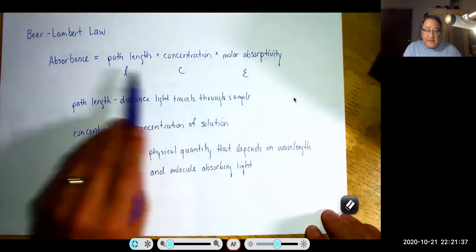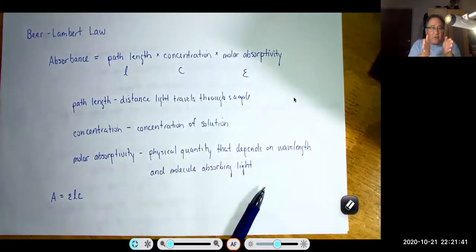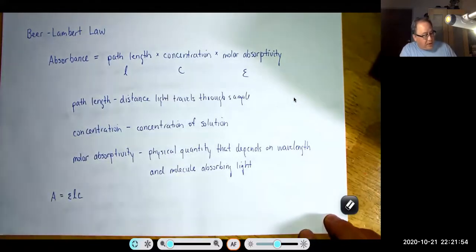Naturally, absorbance is proportional to concentration. If you have a solution of one concentration and light gets absorbed, and you double that concentration, you will double the number of molecules the light runs into and double the amount of light absorbed. So absorbance is also proportional to concentration.